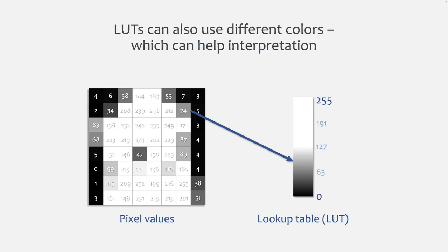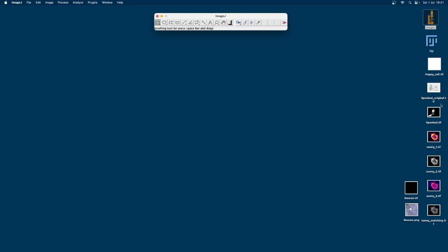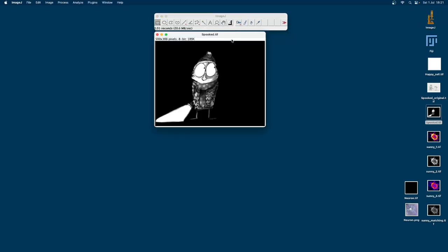And so that's a really crucial distinction to be able to make. So I'm gonna skip over here and show it to you in action in the ImageJ software. So here I've opened up ImageJ. If you're incredibly new to the software, it's important to know that you can always open an image just by dragging onto the toolbar. And that's going to speed things up as opposed to going around and pressing file and open, all that kind of thing.